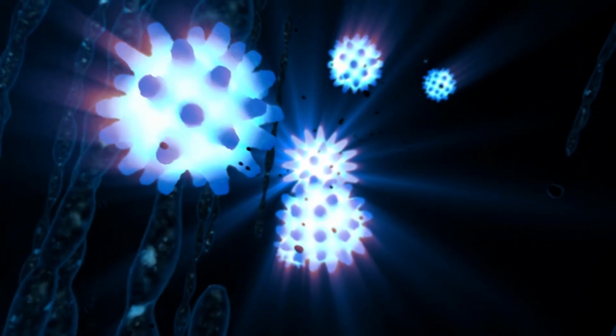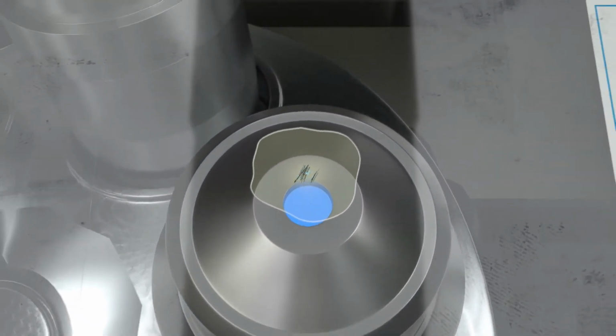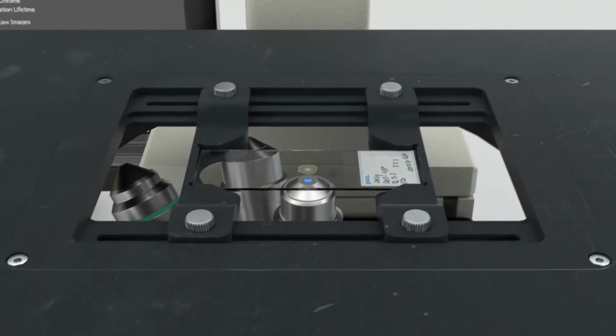Fluorescence Lifetime Imaging, or FLIM, in the time and frequency domain. The differences in fluorescence lifetimes in luminophores can be used as an imaging technique called FLIM. This can be achieved both in the time and the frequency domain.